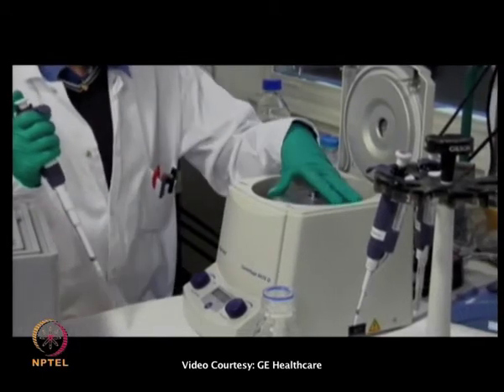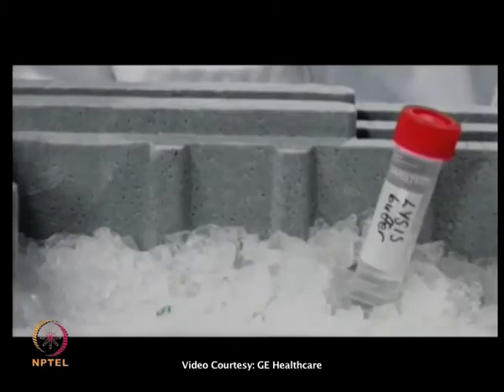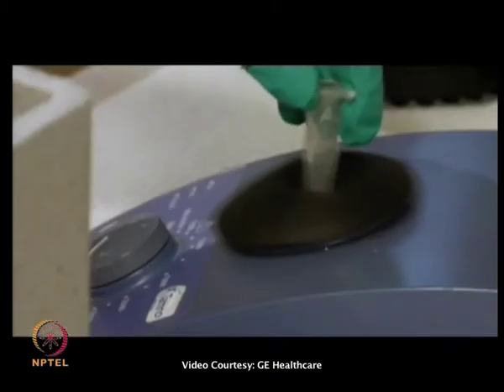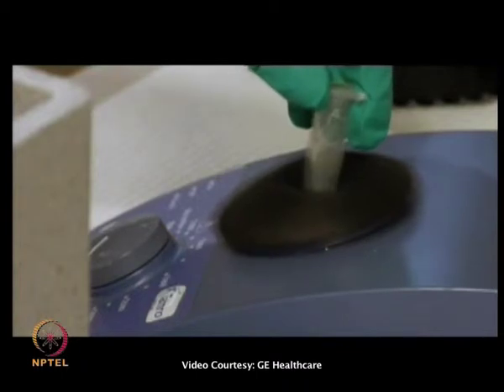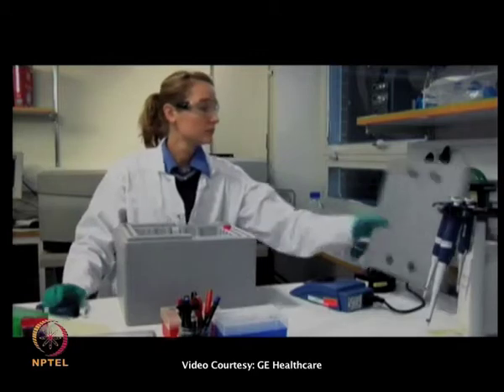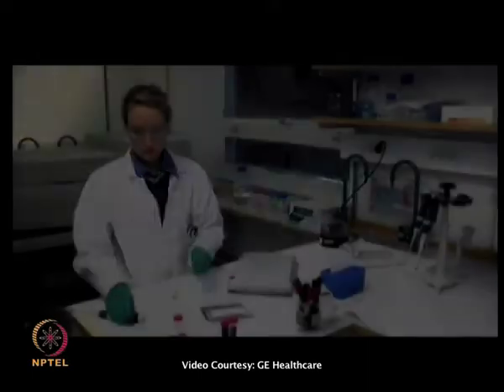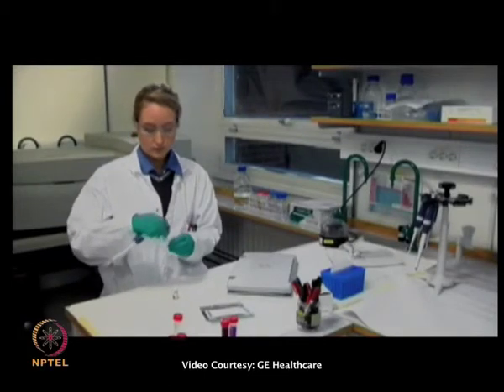The proteins on the cell surface are now labeled and the cells are washed and ready to be lysed. The pellet from the last washing step is resuspended in 150 microliter cold lysis buffer containing 7 molar urea, 2 molar thiourea, 4% CHAPS, 30 millimolar Tris, 5 millimolar magnesium acetate, pH 8.5, and left on ice for at least 1 hour with occasional vortexing.